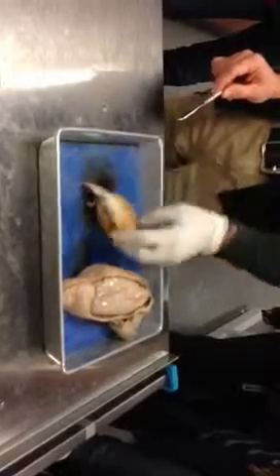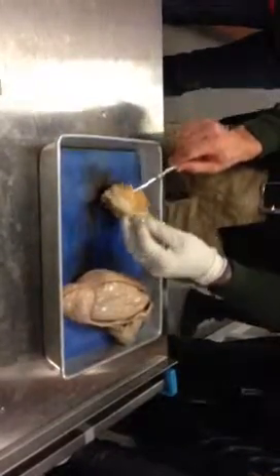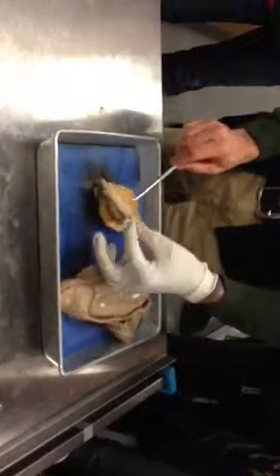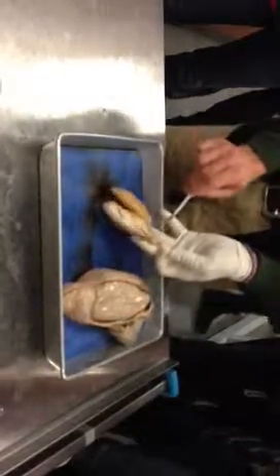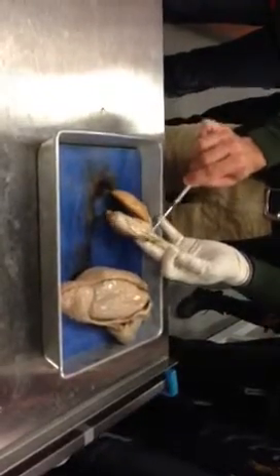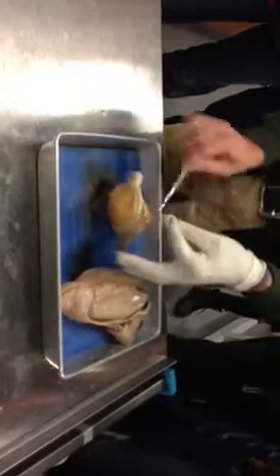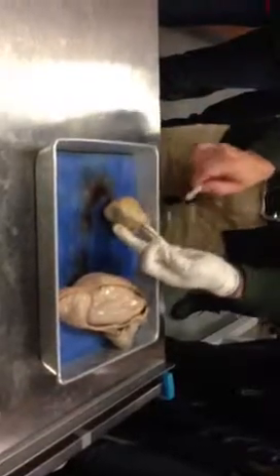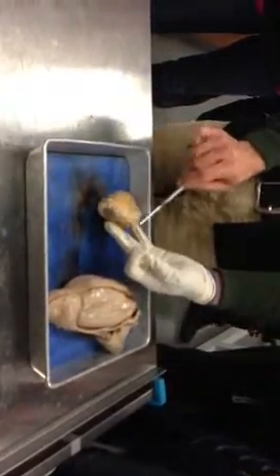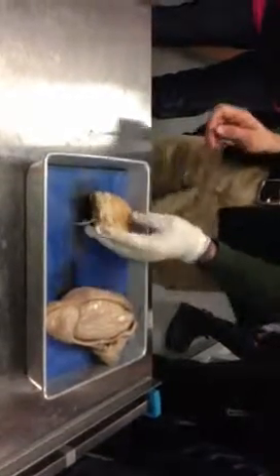Over on the sheep testicle, you see a vas deferens. It hasn't been dissected quite so much. This is it here. Vas deferens coming up from the tail of the epididymis. So there's a vas deferens. It's been a little dissected away from the spermatic cord, but it's still kind of attached there. Anything else?